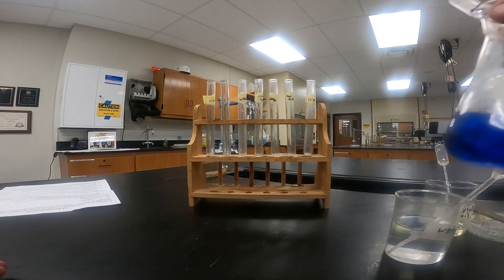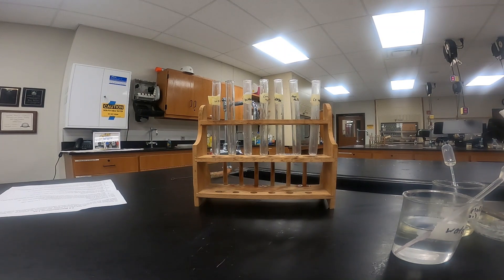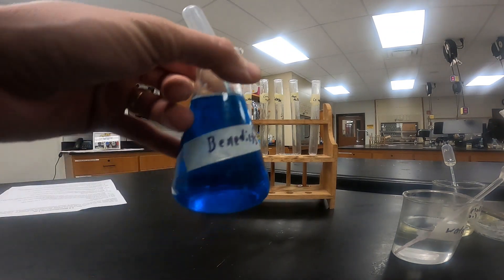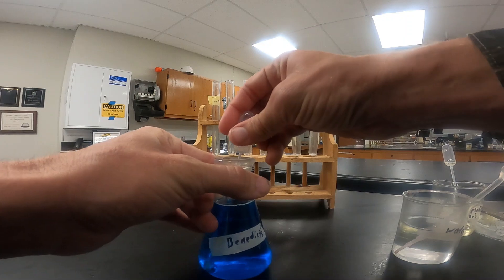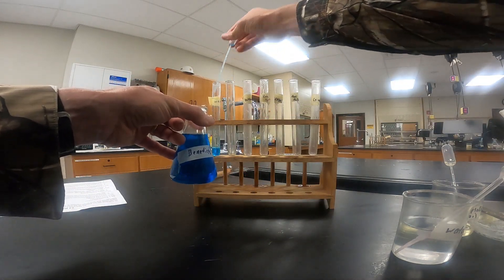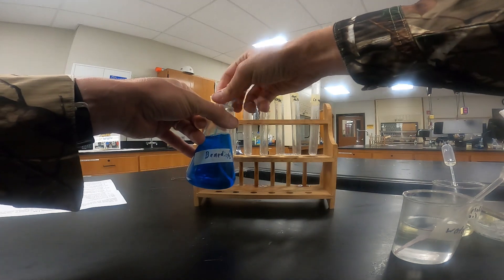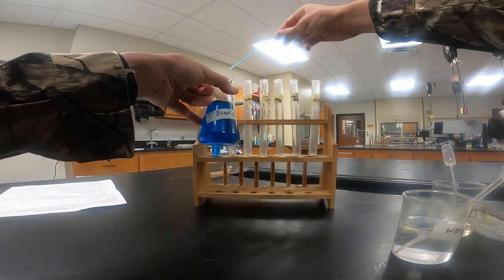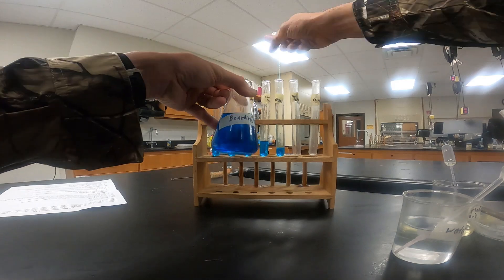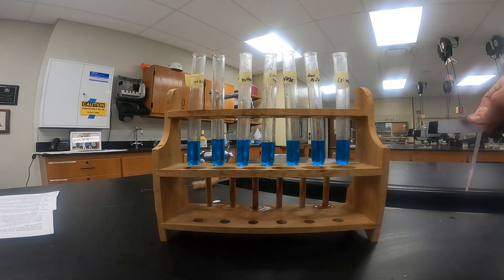Our first test is our Benedict's test, testing for the presence of simple sugars. We're going to do that by adding five milliliters of the Benedict's solution — about two squirts into each one of these test tubes. We'll repeat that process for all six test tubes. Now that we have our Benedict's solution in each test tube, we're going to start adding our test samples.